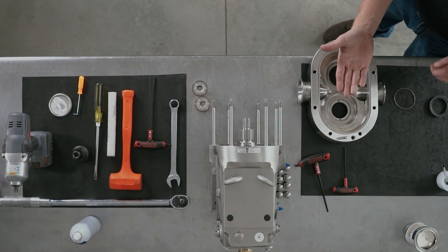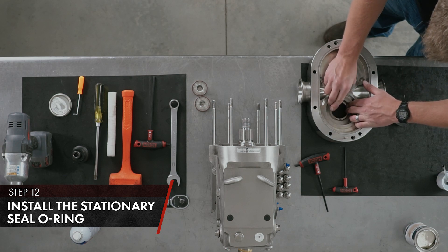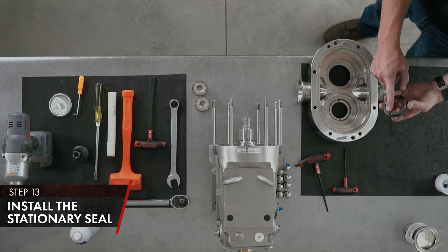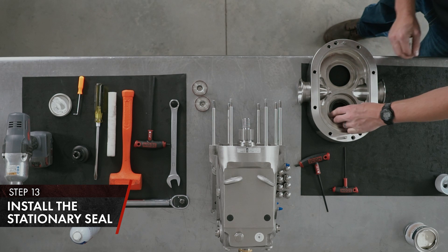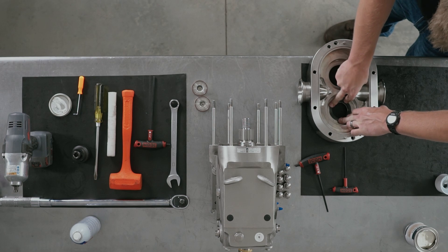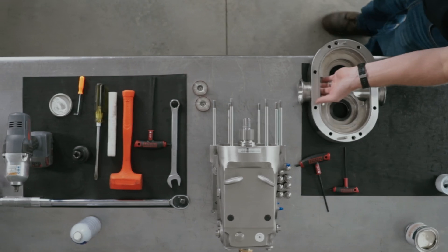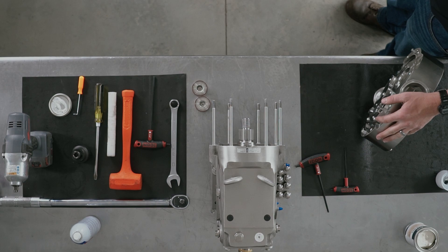With the body on the bench and the product side facing up, get your stationary seal O-ring and your stationary seal. Install your stationary seal O-ring with lubricant, then install your stationary seal with your alignment pins. Check for spring tension. Now you're ready to install your body on your gear case with your double mechanical product seals installed on your U3 pump.